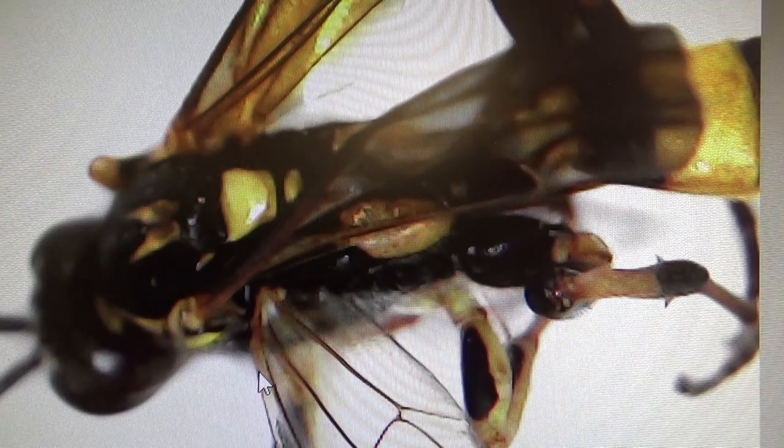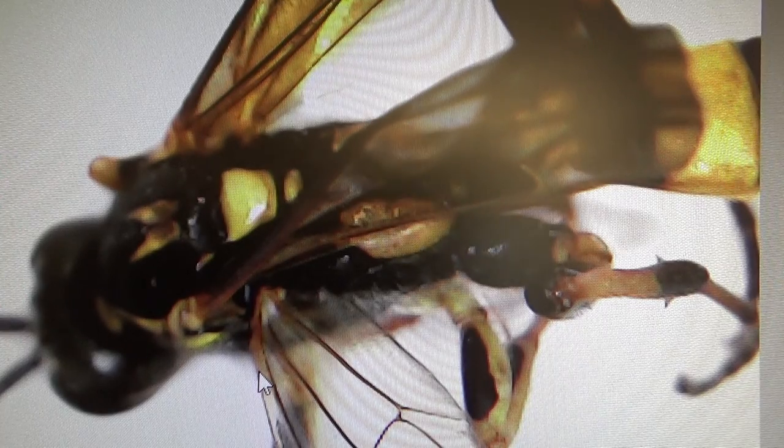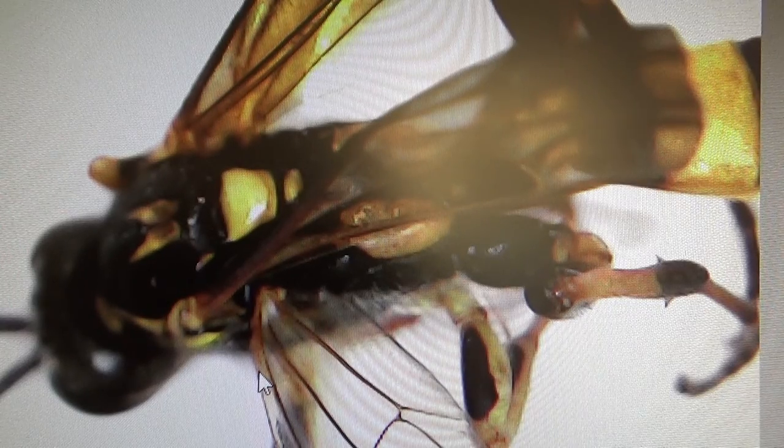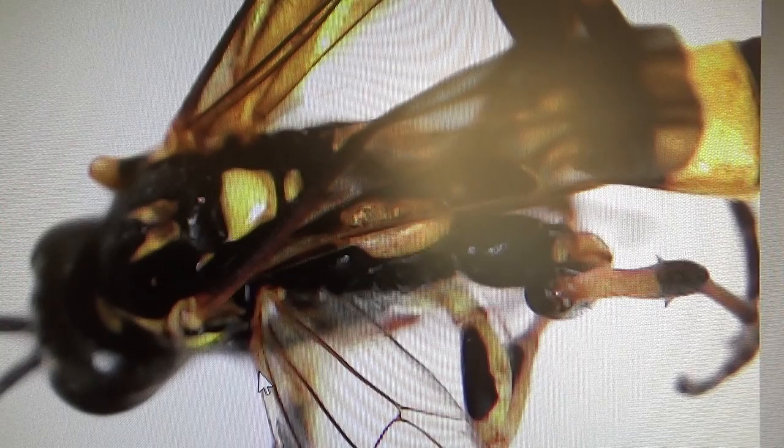I just got rid of that little glare I had there - I still see some of it. Look at that, isn't that interesting? You can see all the little details of them.